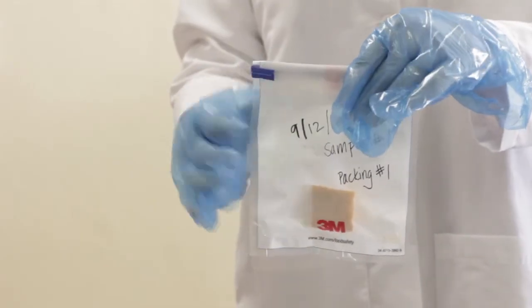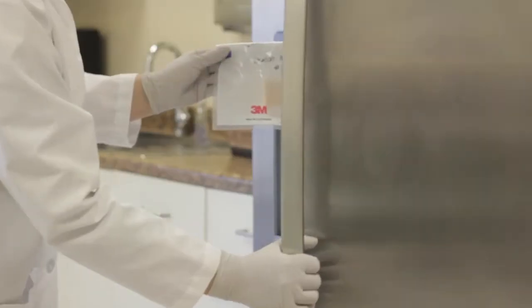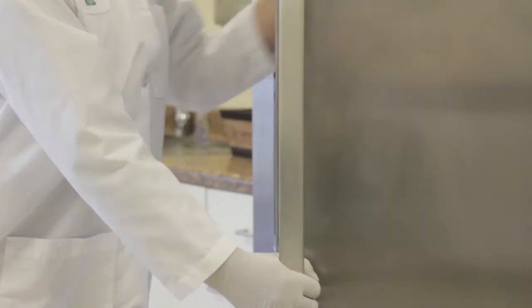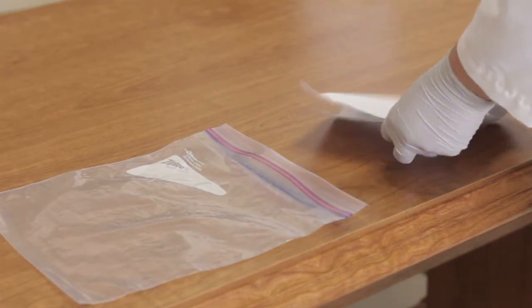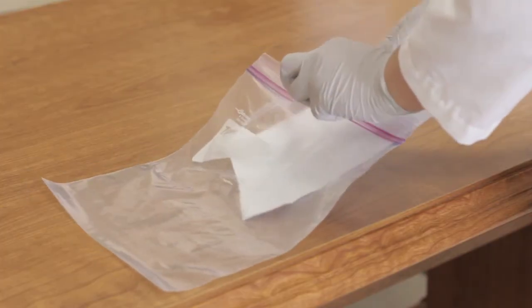Keep the swabs refrigerated at 40 to 45 degrees Fahrenheit until ready to ship the sample to Amtec for analysis. Ship samples with a chain of custody form and ice packs, preferably the same day of collection but no later than the next day.